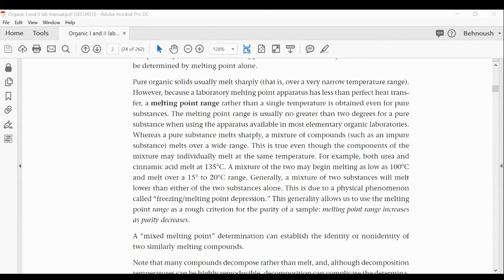My question is, can you put it back and measure the melting point, say that this is solid already, now I'm going back to make it liquid and measure the temperature? Can you reuse the same capillary tube for the same compound? The answer was no, we cannot use it. And the reason we cannot use it, one of the possibilities is on the board now. It says that it's possible decomposition of the compound.